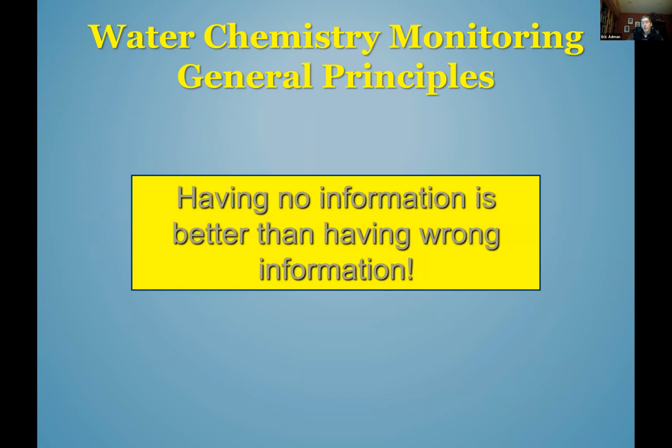And the main general principle that we follow is that having no information is better than having the wrong information. So when in doubt, if you think you may have not done a step correctly, do it over again.